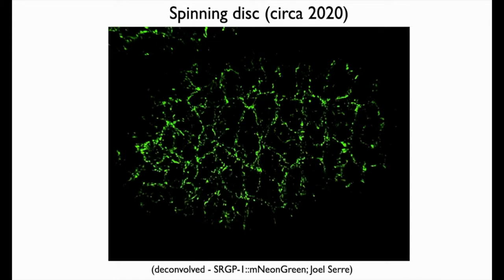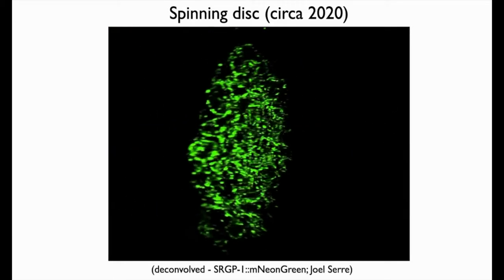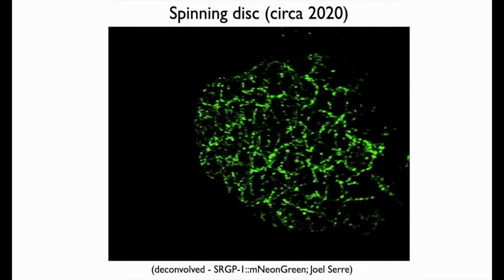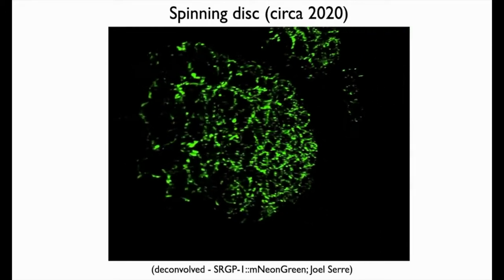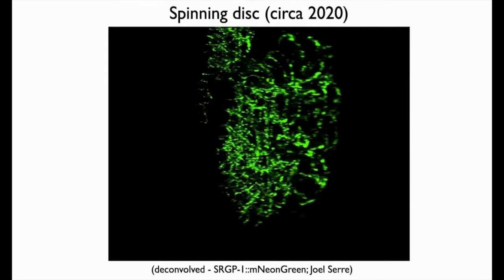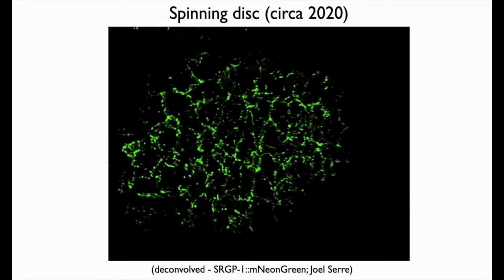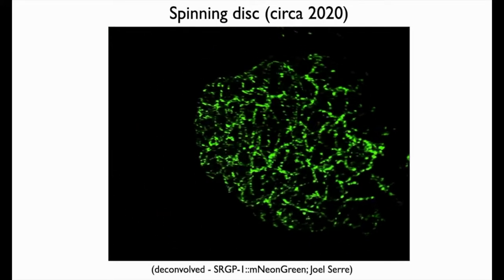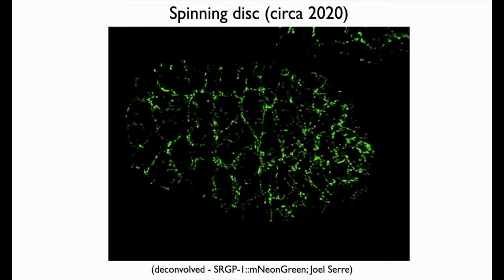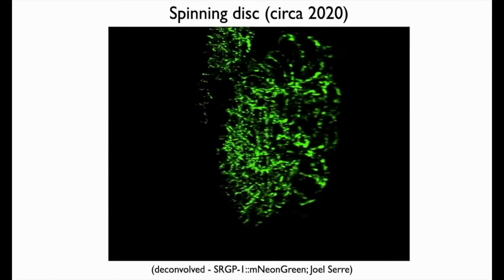What might SR-GAP1 be doing instead? We think it might be modulating membrane curvature. Here's an mNeonGreen knock-in for SR-GAP1 that Joel made, showing it is dynamically deployed at the edges of cells during dorsal intercalation. It looks like SR-GAP1 accumulates in bright spots at sites where cells are going to undergo neighbor exchange. And on the Dragonfly — one of the few images Joel generated before COVID-19 lockdown — this deconvolved snapshot of SR-GAP1-mNeonGreen shows it at the cell periphery, possibly at the tips of cells migrating contralaterally.